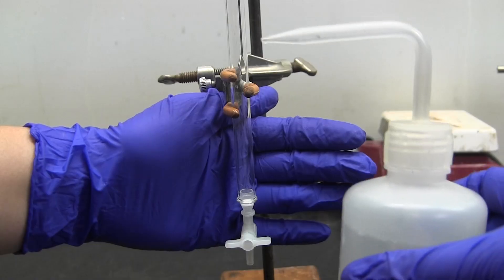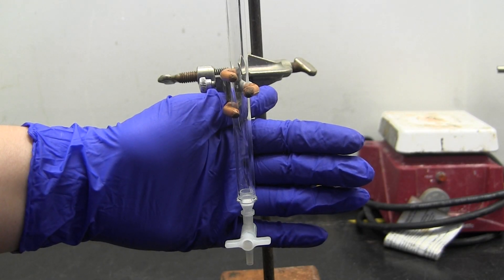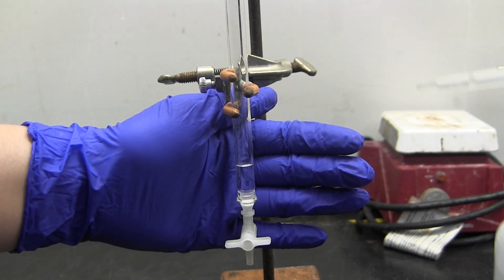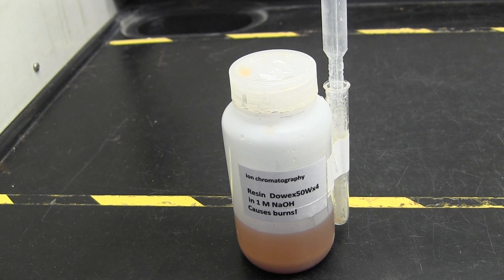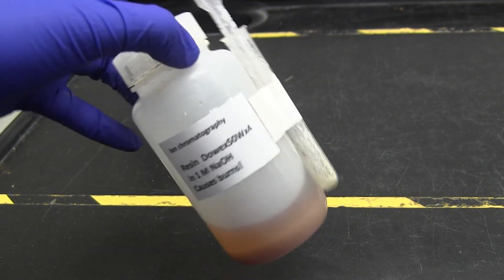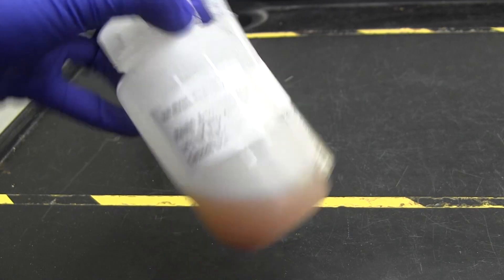Fill the column with about 2 centimeters of deionized water, then locate the bottle of cation exchange resin. Since the resin settles in its solution, swirl and agitate the bottle until the resin is evenly distributed in the solution again.